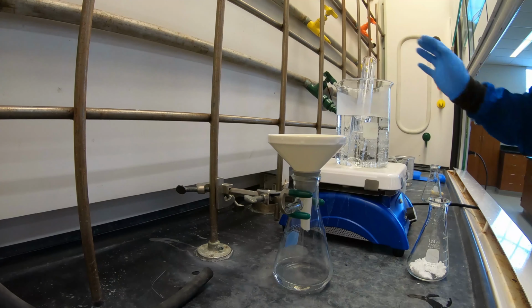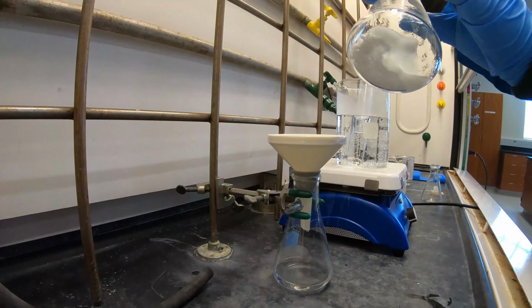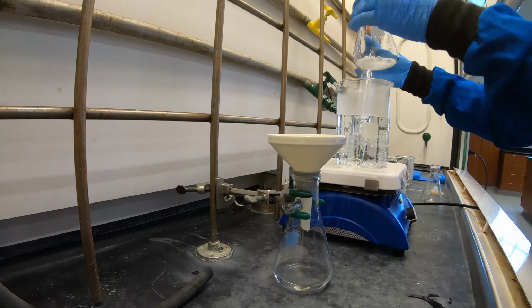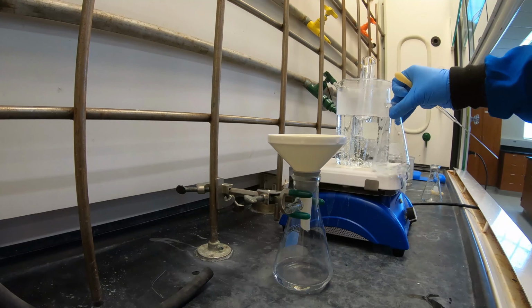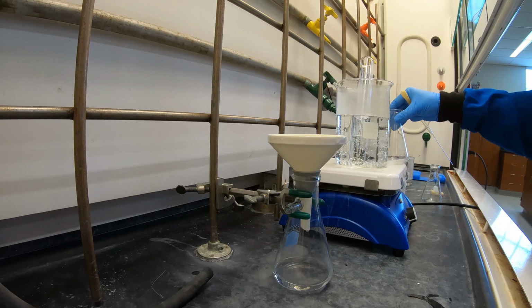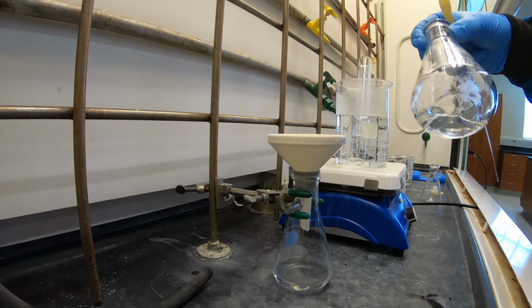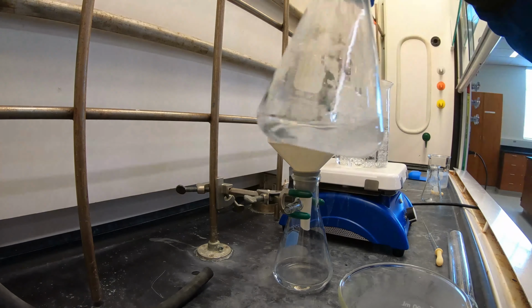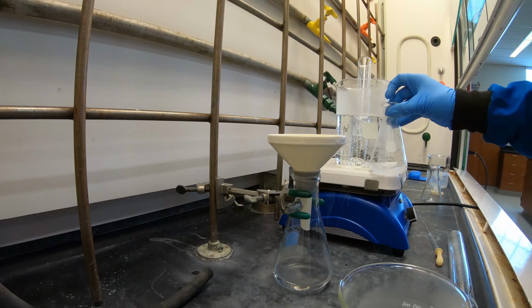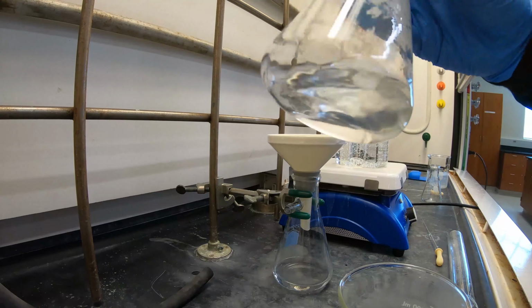Warm 95% ethanol in a hot water bath and then begin to add slowly to your crude product until dissolved. Keep track of the volume of ethanol that you're adding. Once dissolved, add twice the amount of water to the flask. Swirl to combine. Warm the now cloudy solution until clear. Then place in an ice water bath to recrystallize.